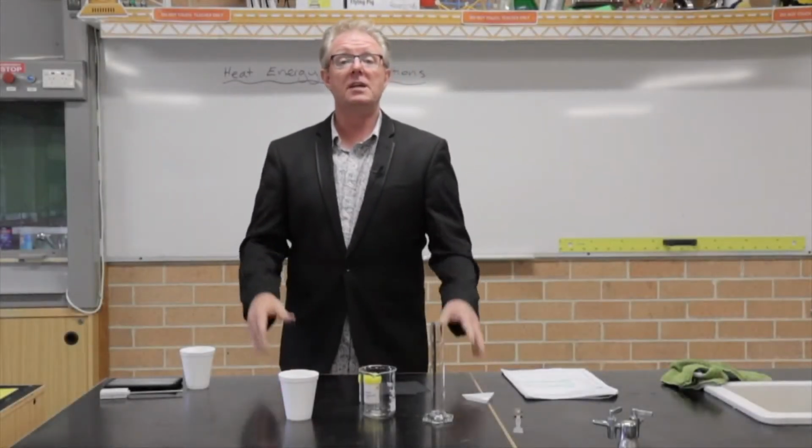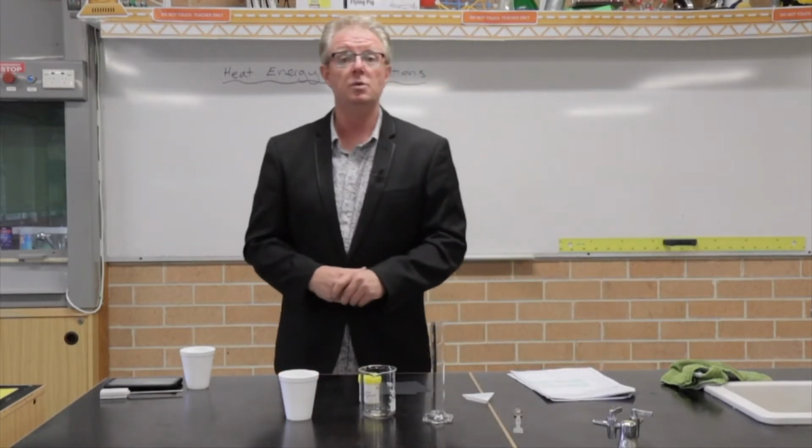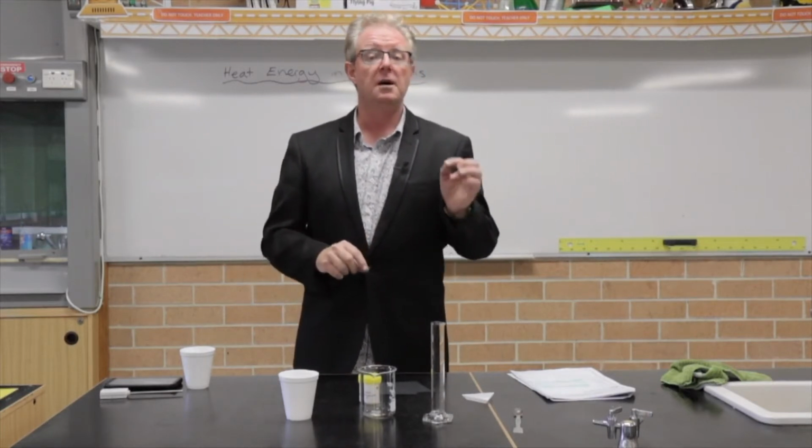Welcome to the experiment looking at heat packs, and this is investigation chemistry number 2. In this investigation, you're going to be exploring the amount of heat released or absorbed by chemical reactions.